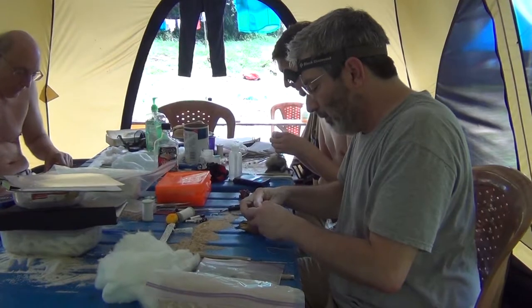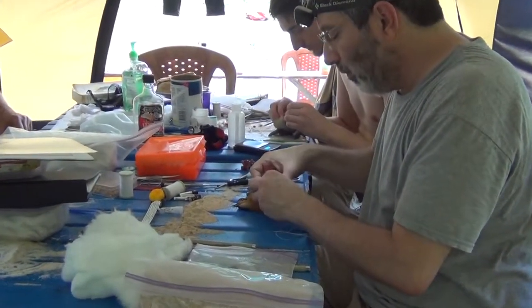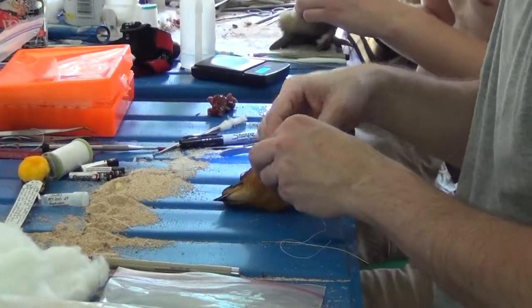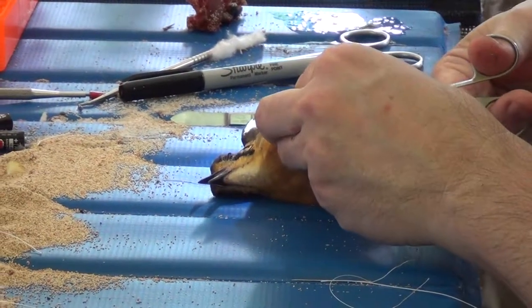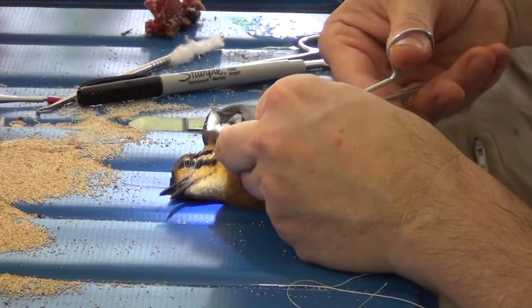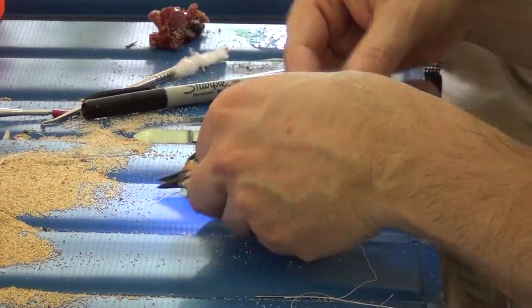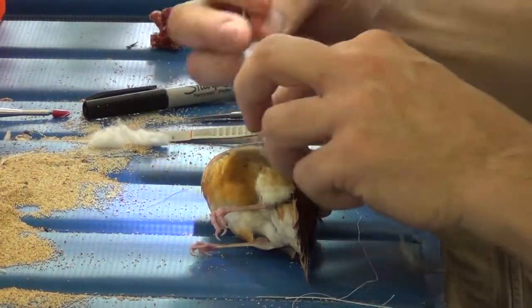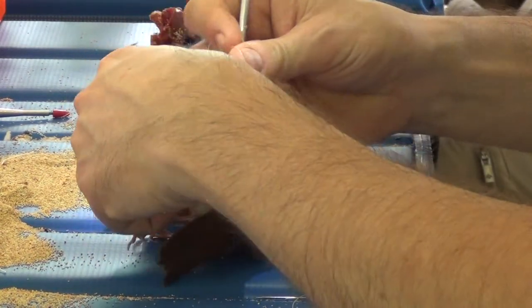Initial incision under the wing. Now I throw sawdust in there to keep the feathers from sticking to the tissue underneath the skin.